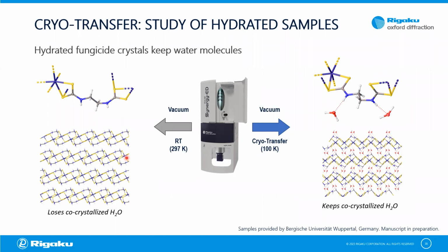And in this case, we could see that it really gives us a lot of benefits, if it's maybe just by reducing beam damage, or if we could also improve the resolution. We can stabilize and protect our samples with the help of cryo transfer. And in some cases, if you have disorder, you could also reduce it.